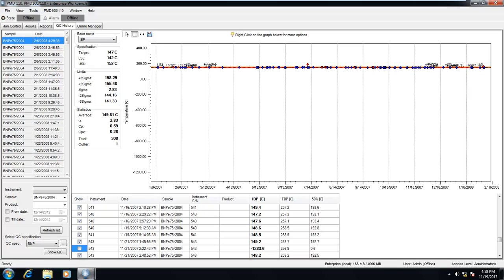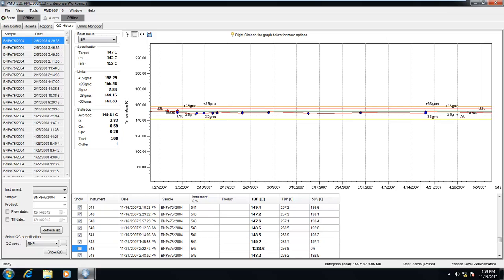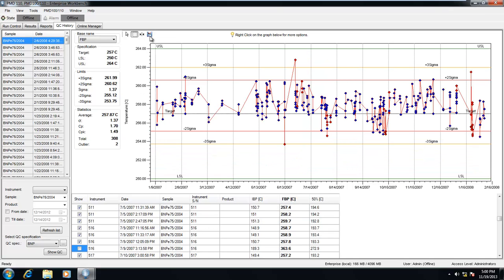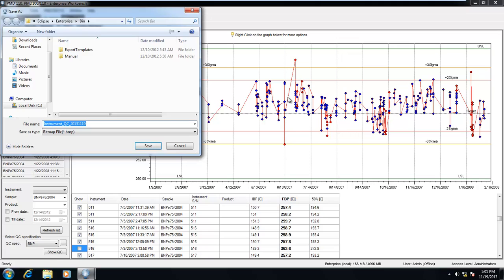The chart will automatically adjust according to its highest and lowest point on the Y axis. The graph also allows the user to zoom into a particular cluster of results by selecting the zoom box and dragging across the graph. The user can select to view information for any point in the specification by using the base name drop-down box and selecting the point they wish to view. Once the user is satisfied with the QC chart, they can use the save button to export the chart in two parts — the graph and the table values — as an Excel document.